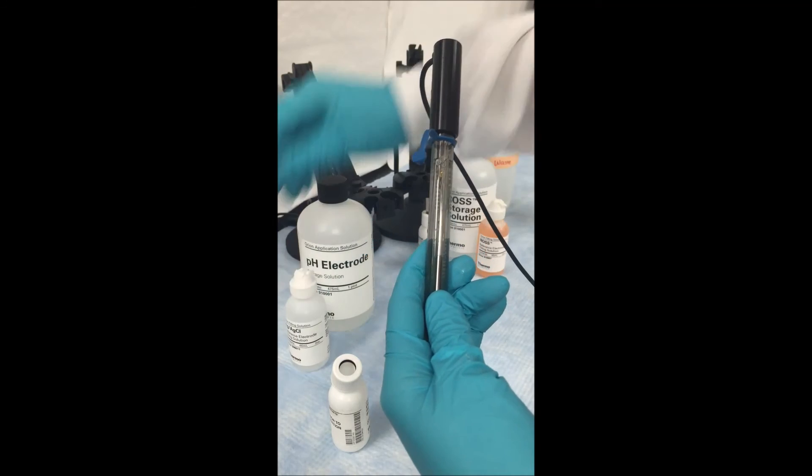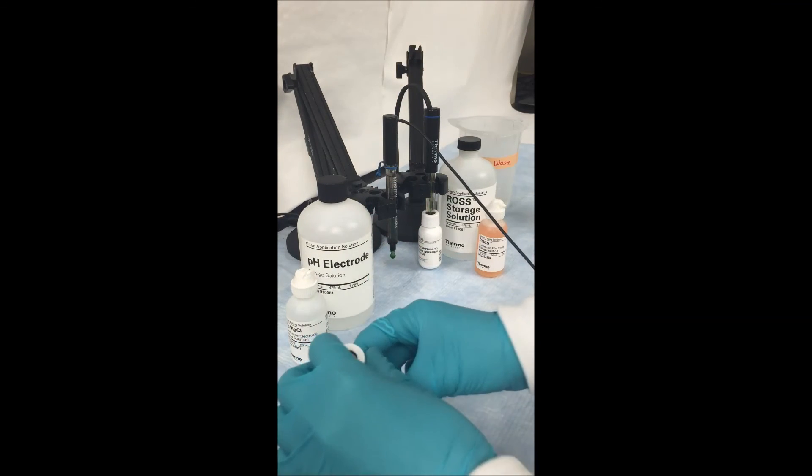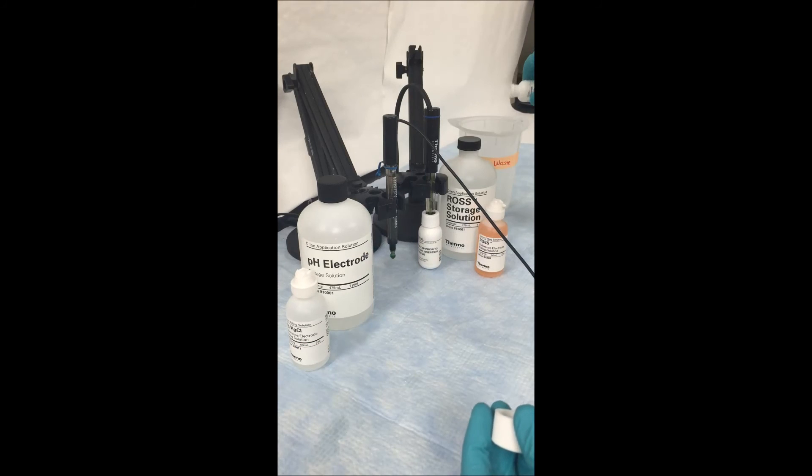Once your electrode is filled, you can begin to start measuring your samples. In order to keep your electrode clean, you want to make sure that you change your storage solution at least twice a month.